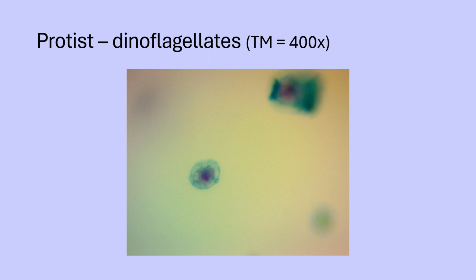As I previously said, oftentimes a stain is added for you to be able to more easily see your specimen, but notice the color on that.